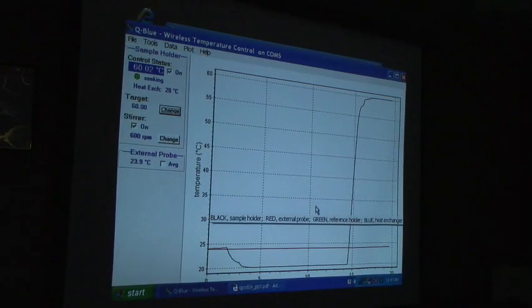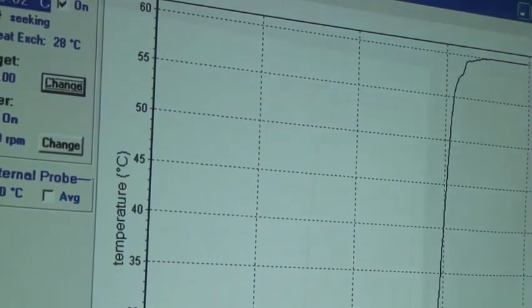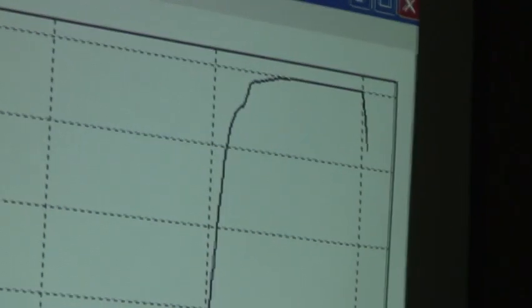It's slower going down. So it's on its way down to 20, which as I said is a little slower than going up, but it's still pretty fast.